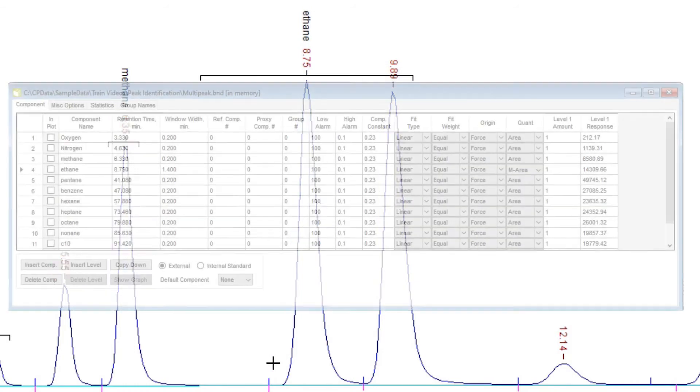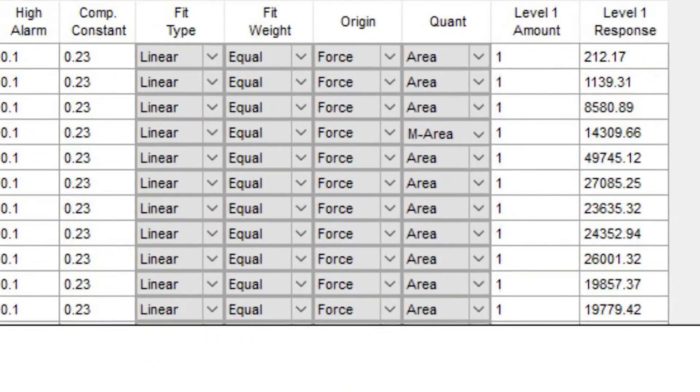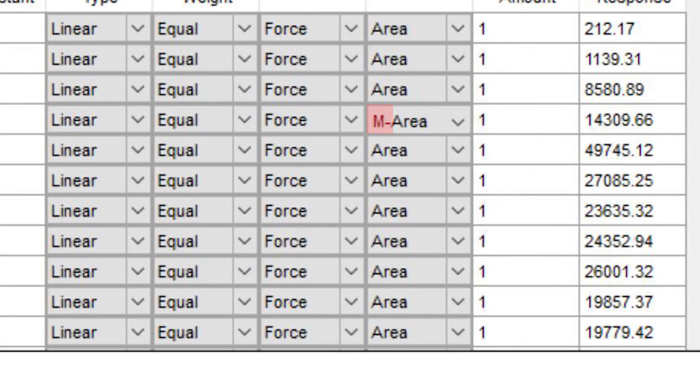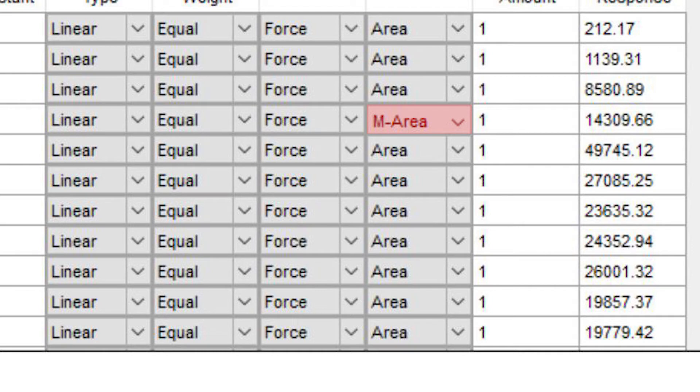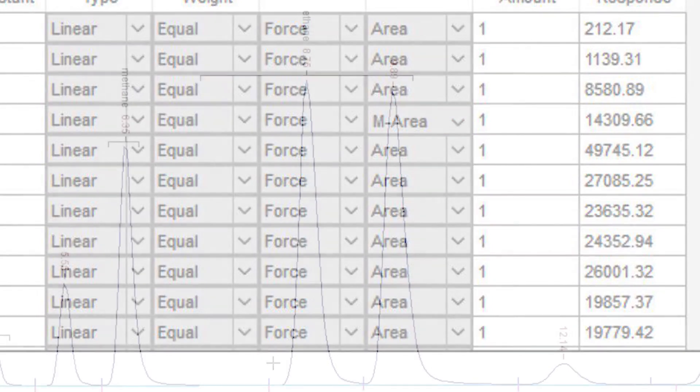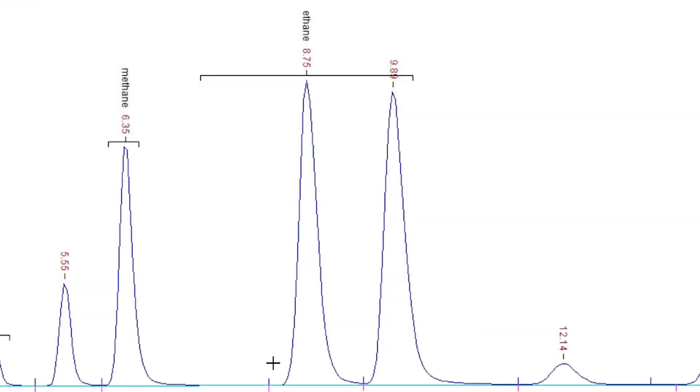Furthermore, if, in the calibration file, the quantization type of a component is set to multi-peak area or height, then two things happen. First, calibration updates use all the peaks that lie under the window to determine the response for that component.